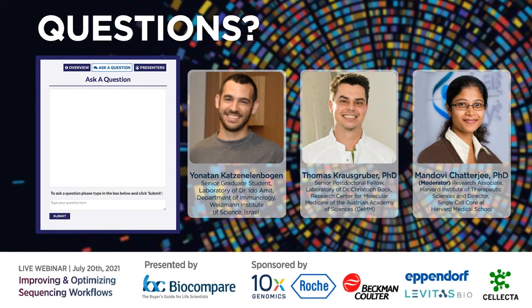At the end of the analytical part, we're using things that we call metacells, which are a bunch of cells, usually dozens of cells that express more or less the same genes, and we treat them as one cell. But we're using an in-house technology. I'm not that familiar with other technologies.